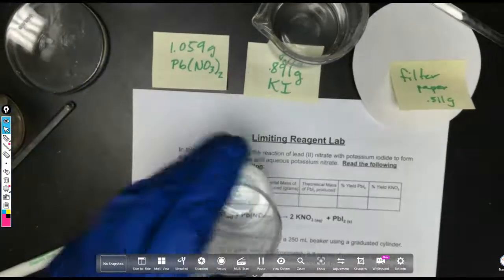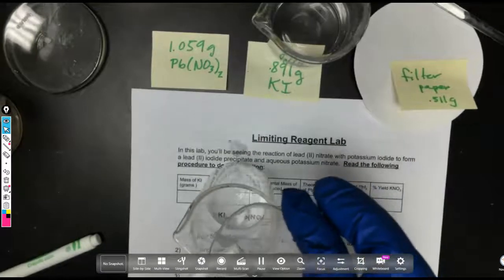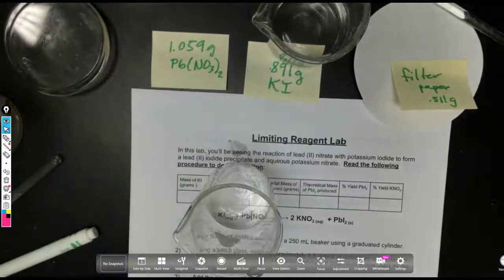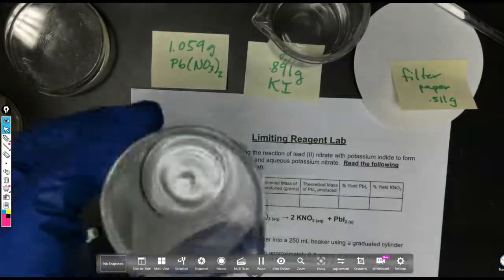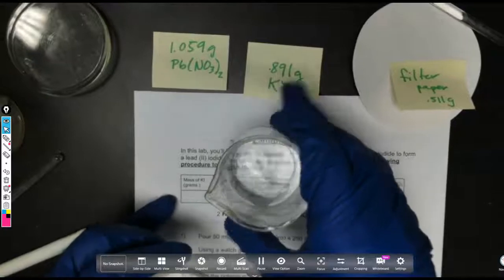Okay, and I am going to go ahead and get all of that into, and I forgot to put the water in. I'm going to go ahead and add the water right now. And that is going to be, let's see here, distilled water, approximately 1 gram of lead II nitrate. Alright, so what this says to do, and I got ahead of myself, is to add that potassium iodide, which you might be able to see is a white powder, to my lead II nitrate.